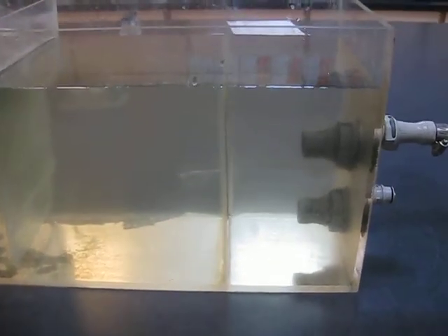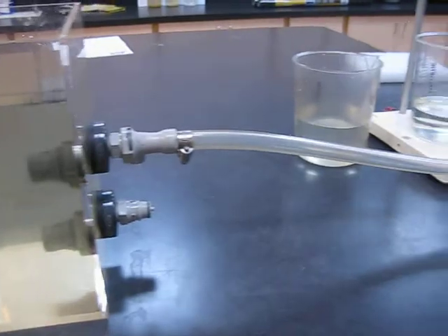And in the second section you can see that the water is relatively clear and free from solids. And then from the second section we have an overflow into an outlet, which flows into a bucket.